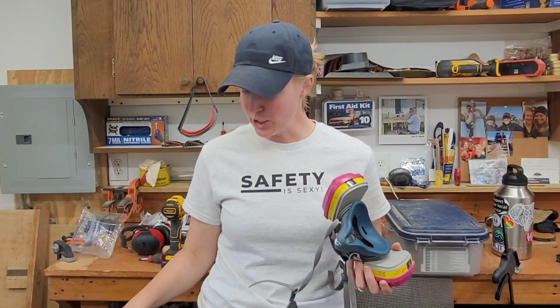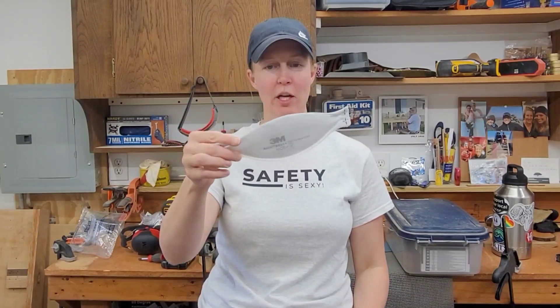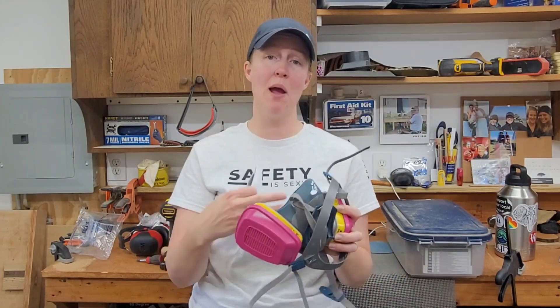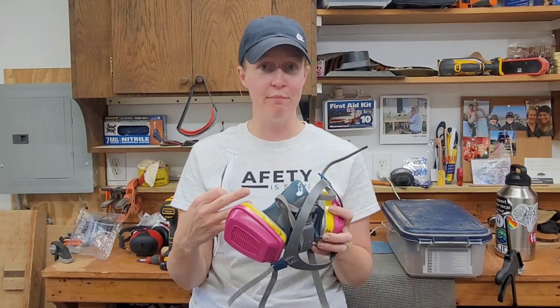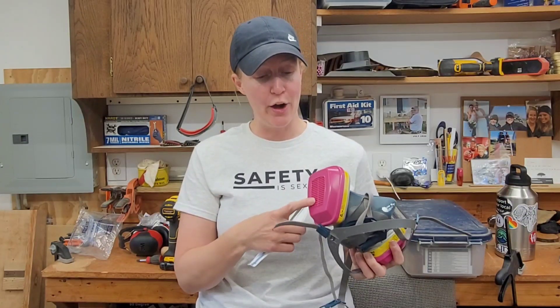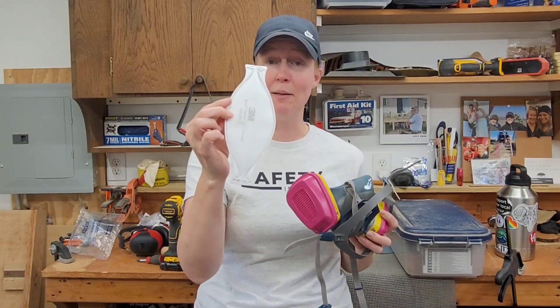I want to talk a little bit about respiratory protection. First off, this here that we normally call a dust mask is actually a filtering facepiece respirator. This is a half-face elastomeric style respirator. Both of these are air purifying respirators, meaning that you're drawing the air through a filtering medium.